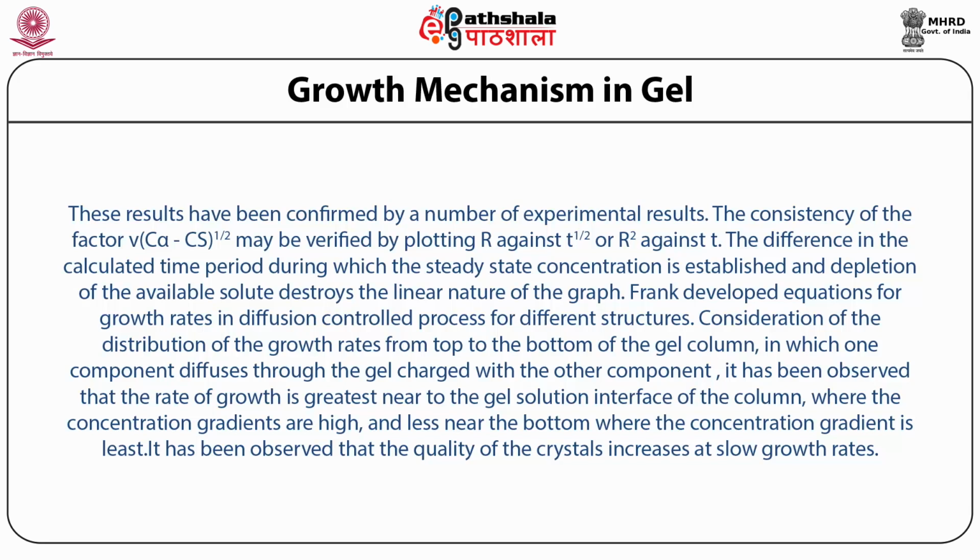Frank developed equations for growth rates in diffusion control process for different structures. Consideration of the distribution of the growth rates from top to the bottom of the gel column, in which one component diffuses through the gel, charged with the other component.